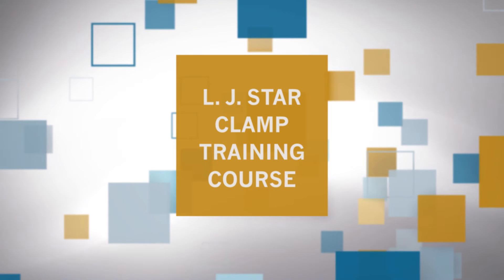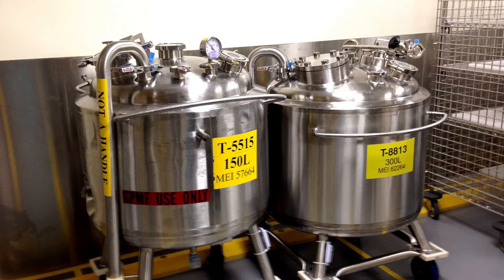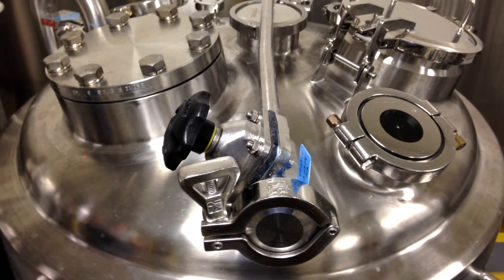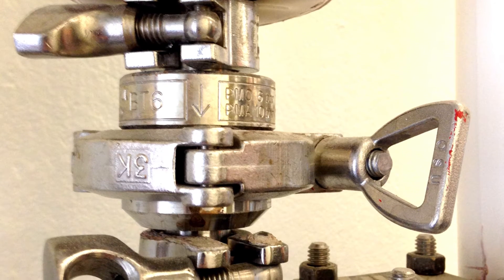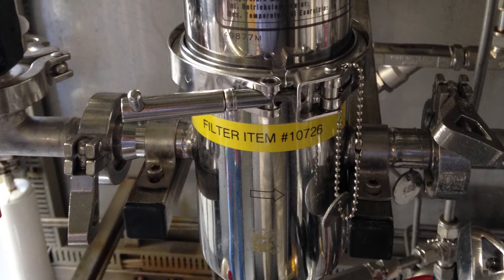Welcome to your LJSTAR clamp installation and maintenance training video. In the pharmaceutical and biotech world, process equipment is frequently disassembled for cleaning and reconfiguration. Proper installation, inspection, and maintenance of these connections is critical to ensuring they operate as designed.